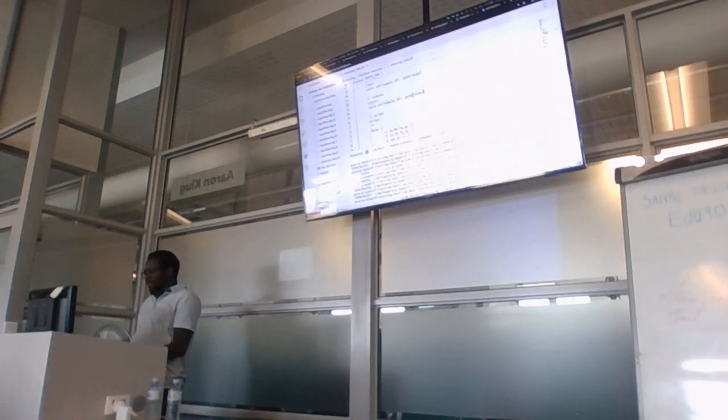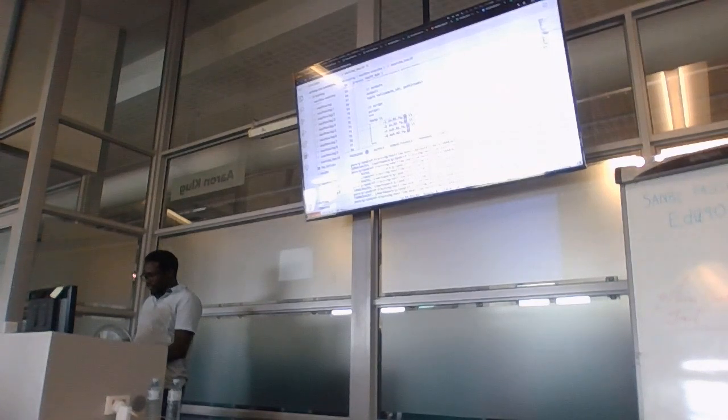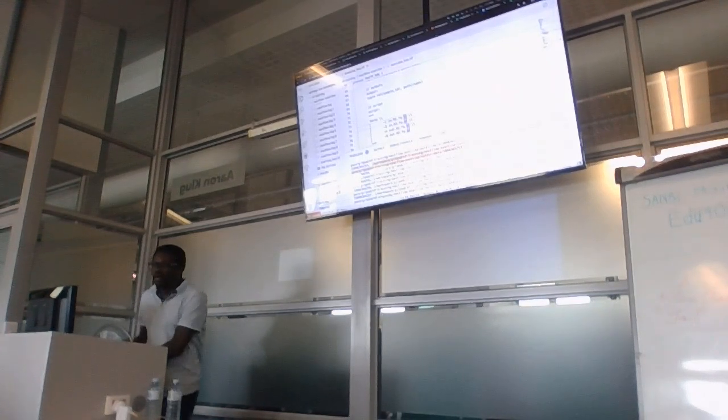Now, how do we plug in this information into our script? When you look at the channel as it is, what you're interested in is identifying in this reads value what index it is in our array.